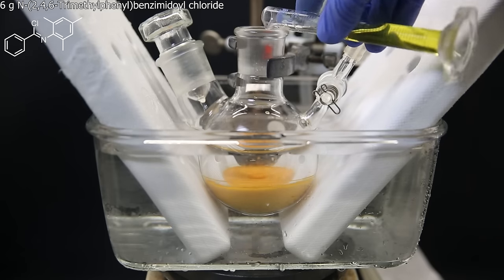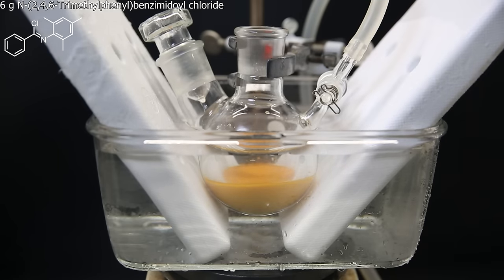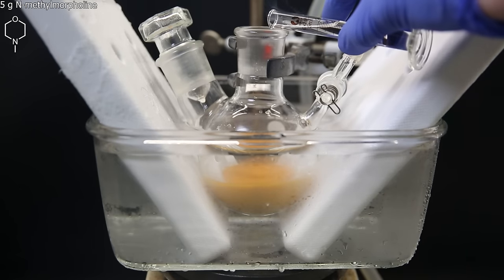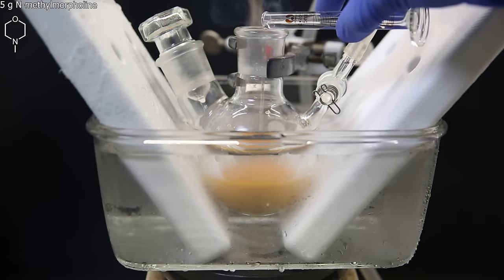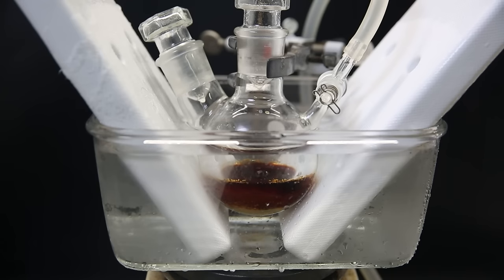On top of that, I add in 6 grams of the imidyl chloride that I made, and I wash the cylinder a few times with some dry THF. Then as the catalyst, I add in 5 grams of N-methylmorpholine, but I actually only needed 2.5 grams, and this was twice as much as I needed. Oops. The mixture immediately discolors, and I leave it to stir for 30 minutes in the ice bath.